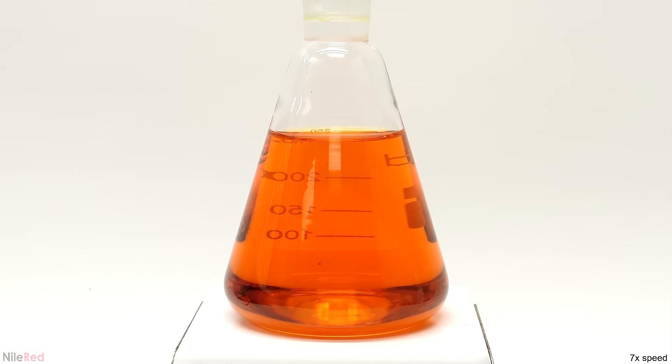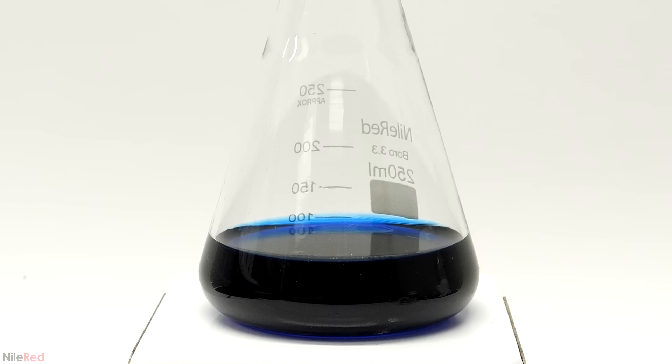So now that you know what the ingredients are and how it's all put together I'm gonna try to explain chemically what's going on. To do that I'm just gonna go back to the moment before the two solutions were mixed. At this point the indigo carmine was in its blue form which dominates when the pH of the solution is less than about 11.4. Distilled water has a neutral pH of around 7 so this was well below the 11.4 threshold.